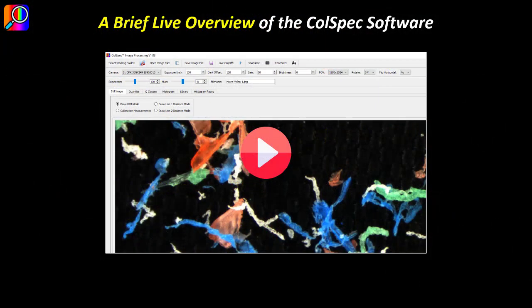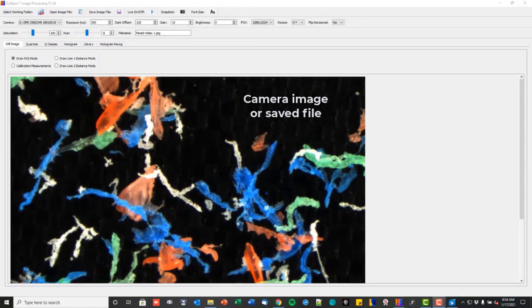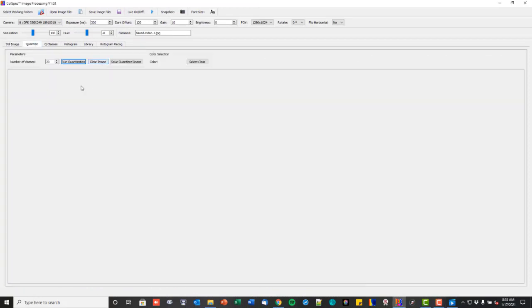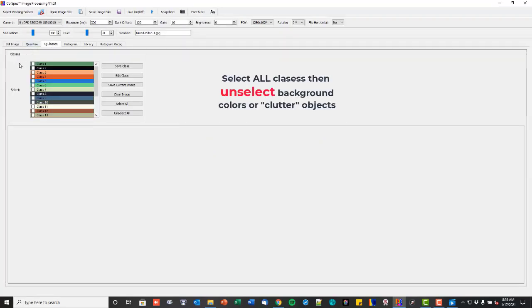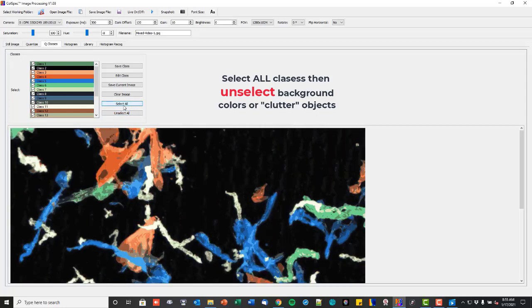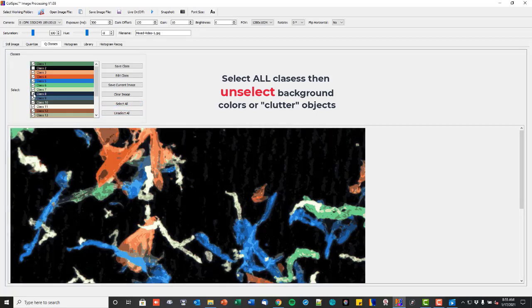Here is a live overview of the Kohlspec software. First, either acquire an image of your sample live, or load a saved file. Quantize the image to reduce the number of colors — then each quantized color becomes a class. Select all classes, then unselect all classes that correlate with background or clutter.